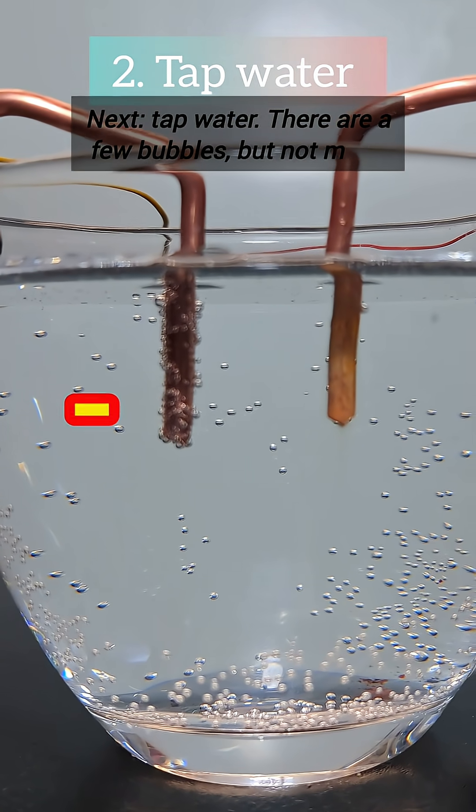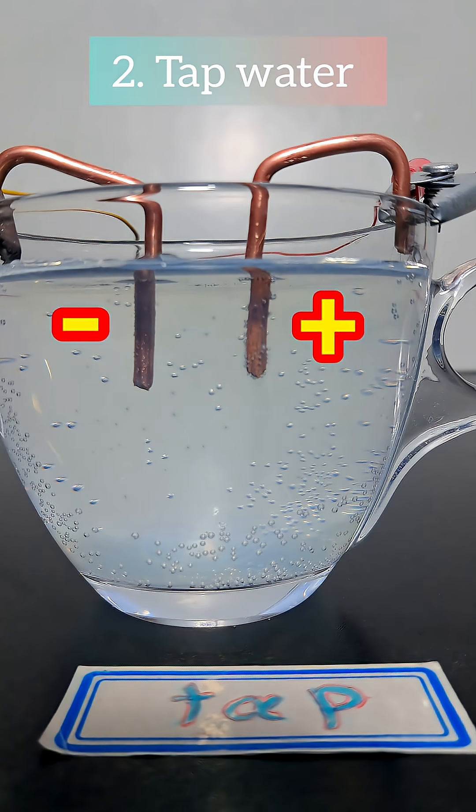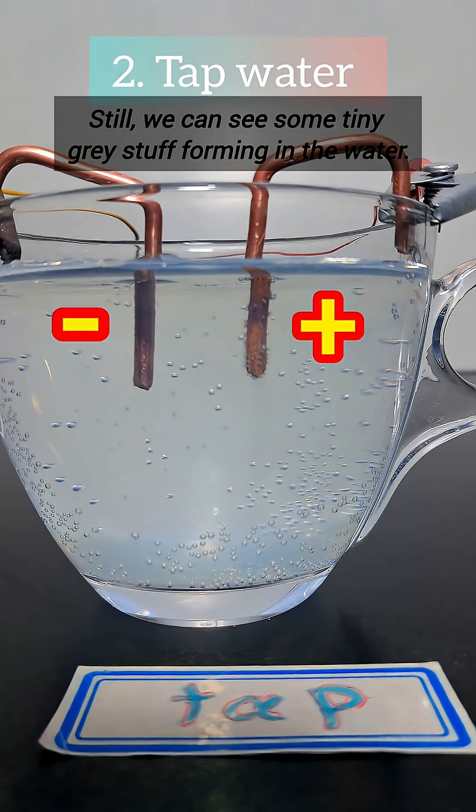Next, tap water. There are a few bubbles, but not much. Still, we can see some tiny grey stuff forming in the water.